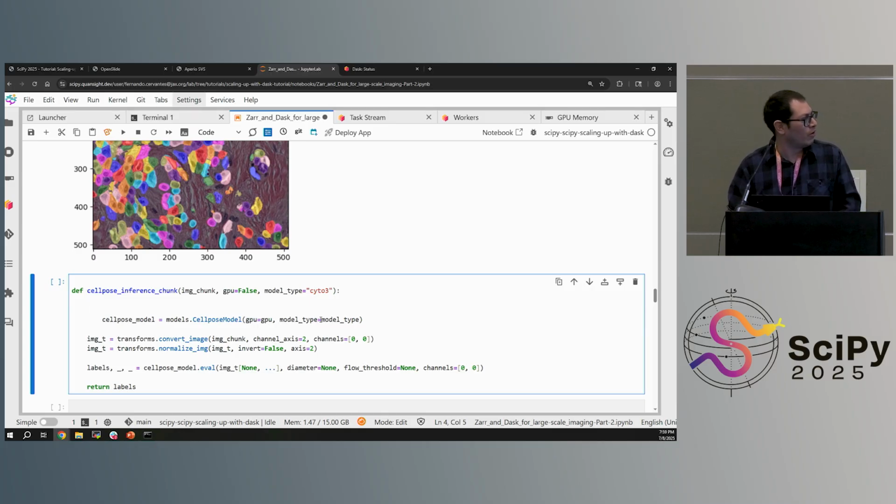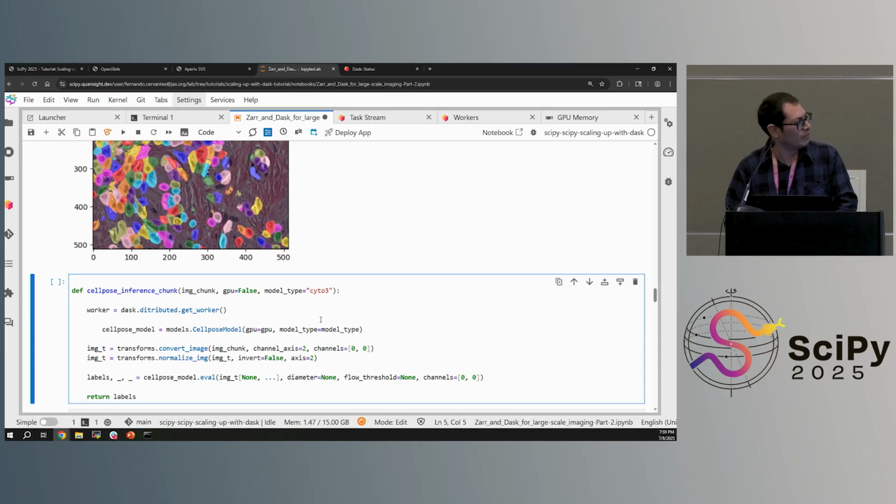So instead of computing on this, I'm going to take just a selection as an example. From our array, I know because I have done this before that if you go to coordinate 8,000 and take, for example, a 512 slice and go to coordinate 2,000 in the x-axis, and again take a 512 slice, you have actually something there inside.